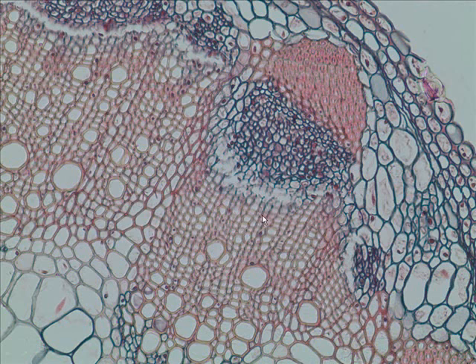And so this is a dicot stem. Do all dicots become woody and have secondary xylem and phloem? No, they don't. There you go. Some dicots become woody, some dicots don't become woody. But if there was some residual procambium, where would it be? It'd be right in here between the primary phloem and the primary xylem.